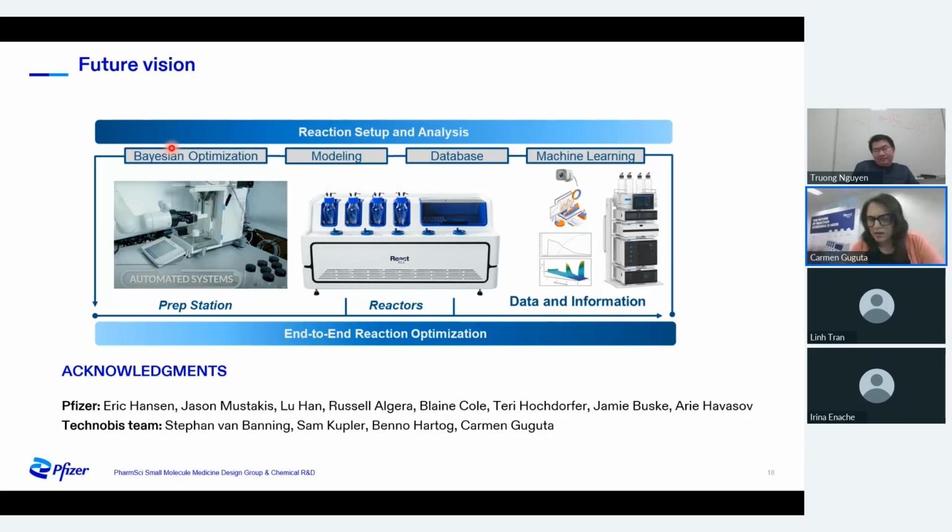Do you recall the volume of the reactor vial? Now I don't have this information, Trong. Fully it is 16 mL. The operational volume is probably 5 mL, because the level needs to be higher than the sampling tube. So a minimum of 5.